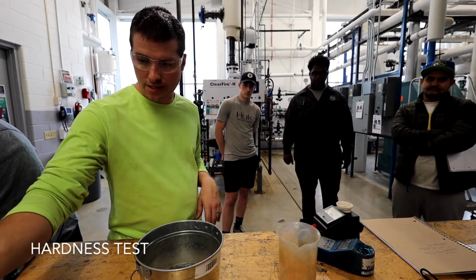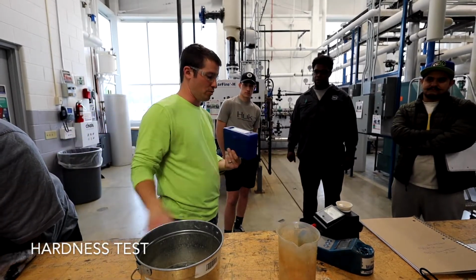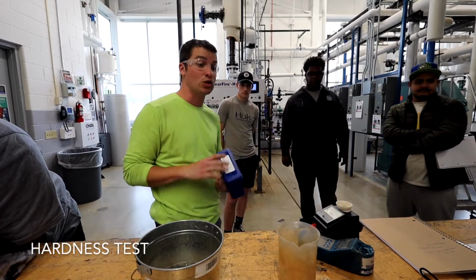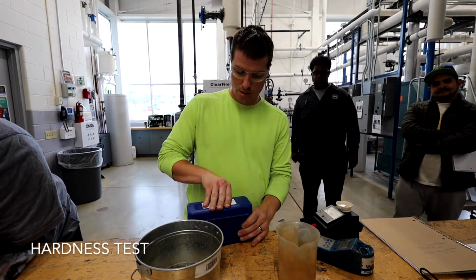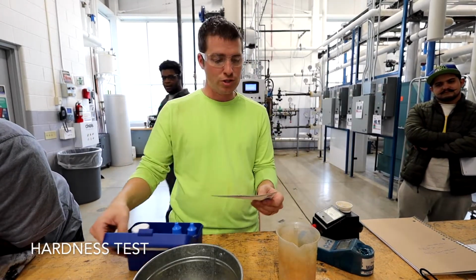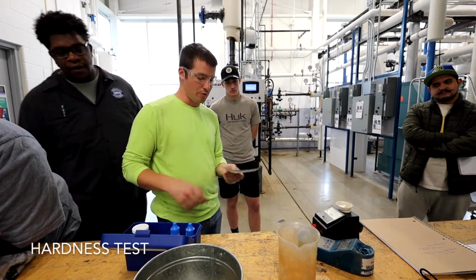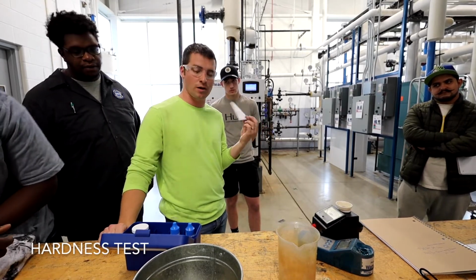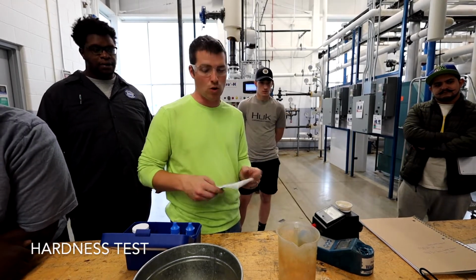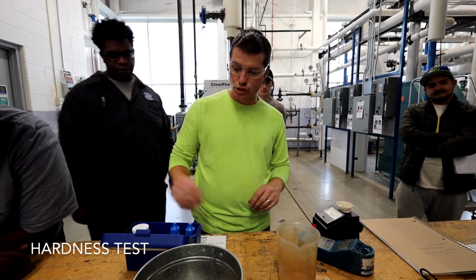The most important test that we run in a whole boiler room, right? We went over it. Alkalinity? Hardness. Hardness, okay. All right, so hardness is the most critical test to run out of everything. These drop test kits are pretty simple. They really are typically only like 3 to 4 steps long. Add a couple drops of this, couple drops of this, color change, read the number, right? So not anything super difficult.